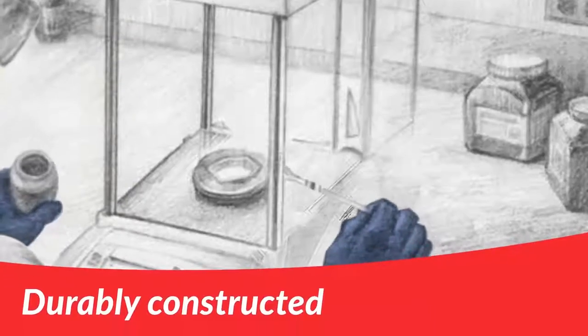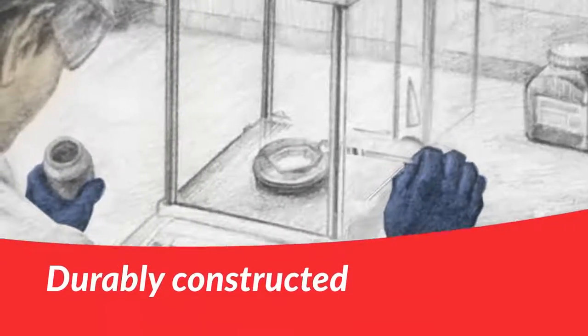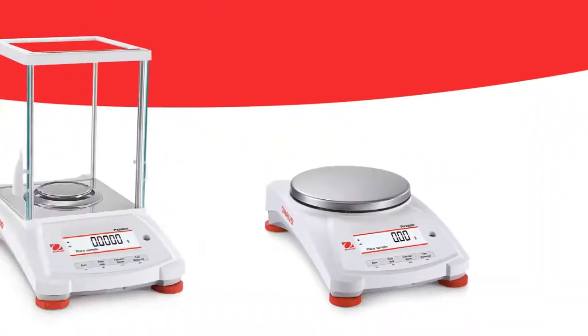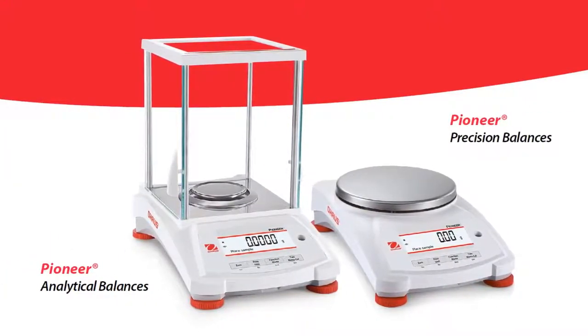It's also durably constructed to last, so your investment in this equipment is long-term. The PX Series is designed for simple, intelligent operation in a variety of professional settings.